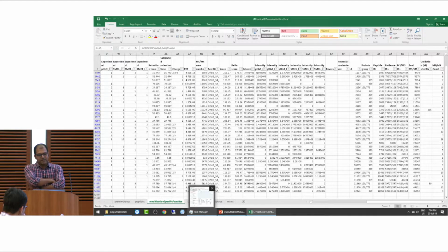So usually, I would say the short answer is, let's say it's not the lowest abundant protein that you're looking at, and you have a drastic change. You will not verify. You go back and verify, but essentially the information is coming from the tables in a backward manner.